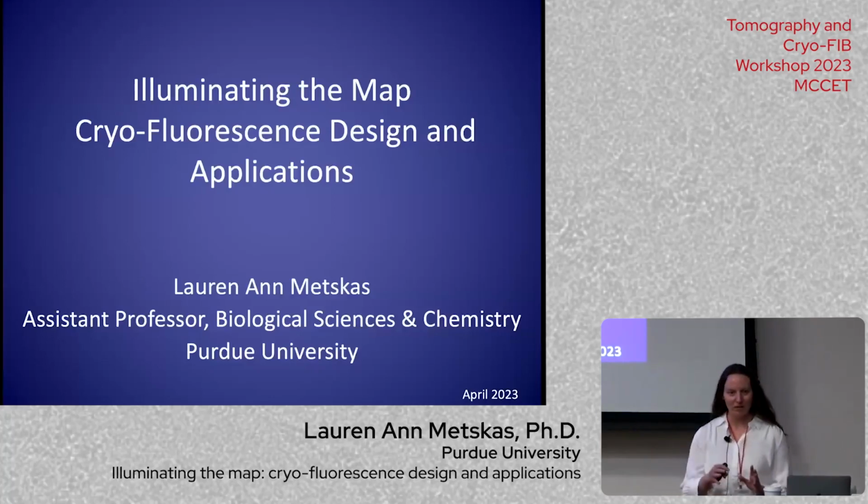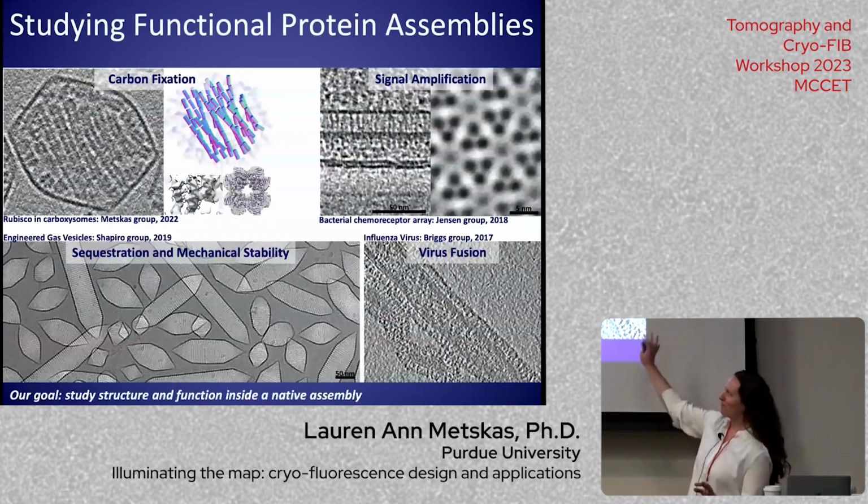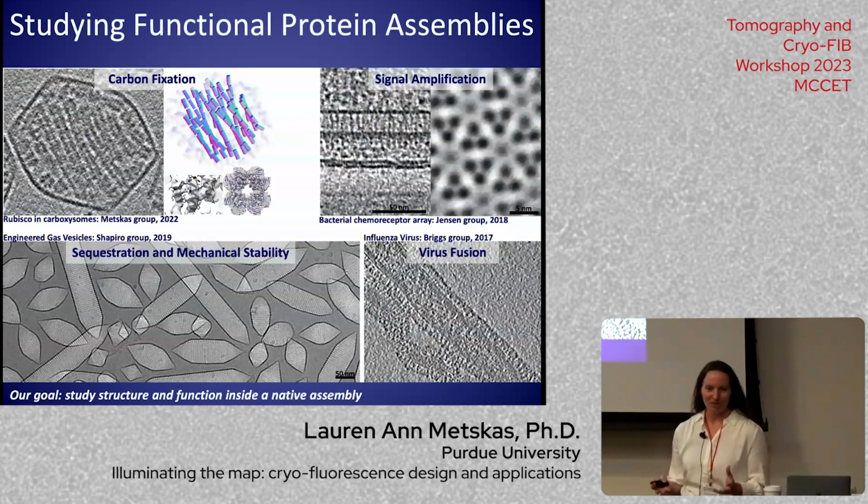fluorescence. We'll go a little bit into theory and a lot into just how do you move forward when you're trying to design a CLEM experiment for the first time. So briefly, this is all of the work that my lab does. So we study functional protein assemblies.